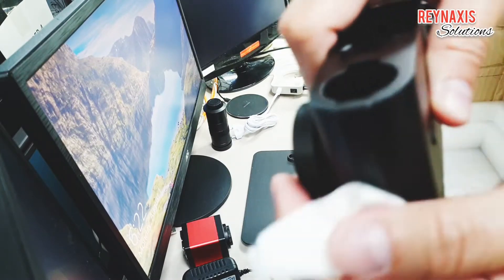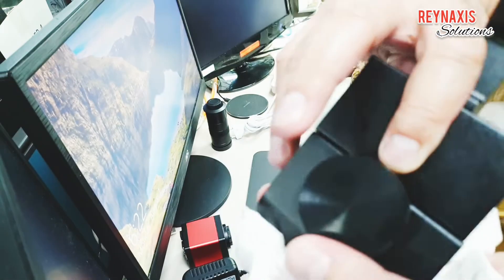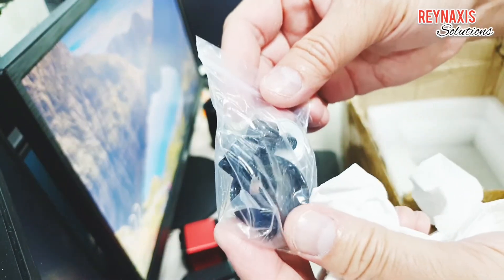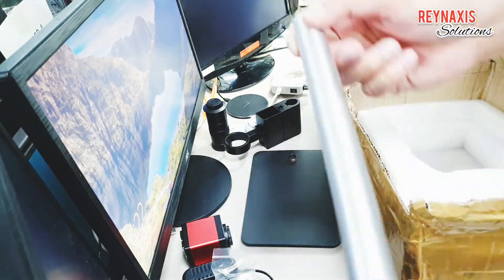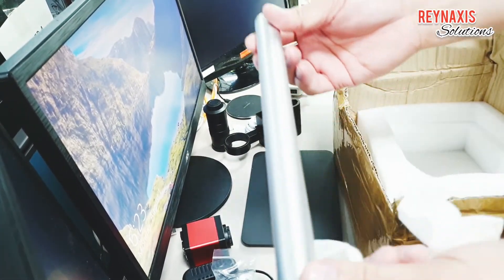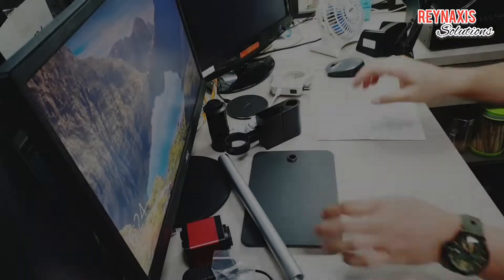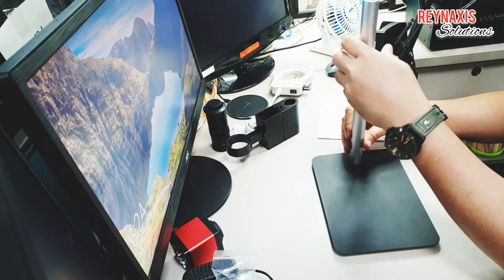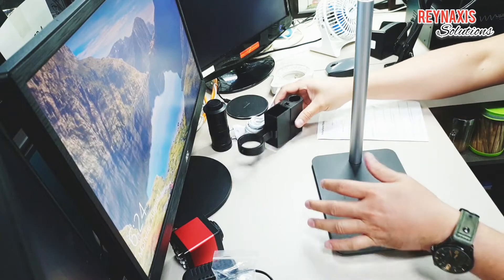Since it doesn't have a manual, I don't know how to orient this on the pole. But I'm guessing that if you're right-handed, then the knob should be on the right side. It also comes with a small ring with screws, and here's the pole that we will use to secure the camera holder and attach it to the metal plate. I'm going to attempt to assemble this microscope without a manual, so sorry if I miss out on something, but we will try.